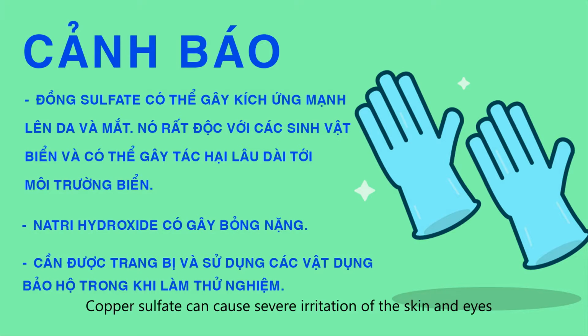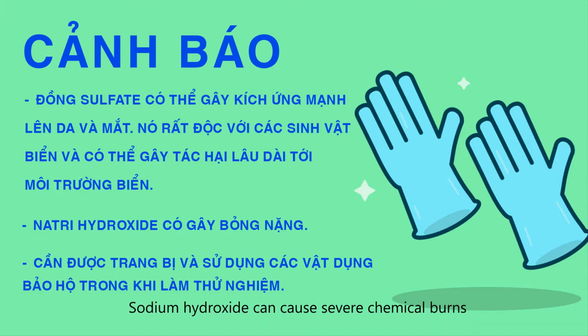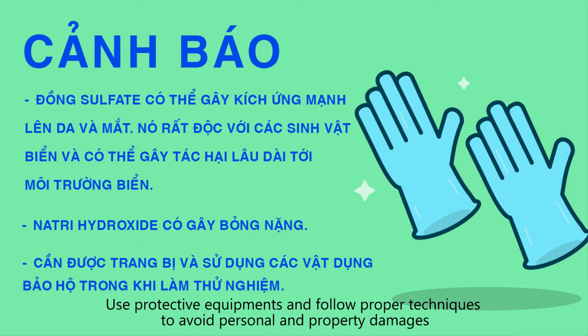Attention! Copper sulfate can cause severe irritation of the skin and eyes. It is very toxic to aquatic life and may cause long-term adverse effects in the aquatic environment. Sodium hydroxide can cause severe chemical burns. Use protective equipment and follow proper techniques to avoid personal and property damages.